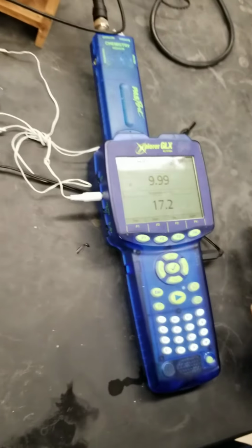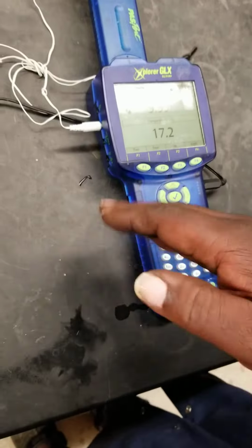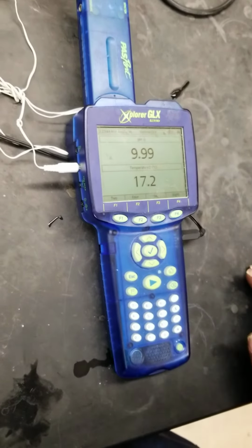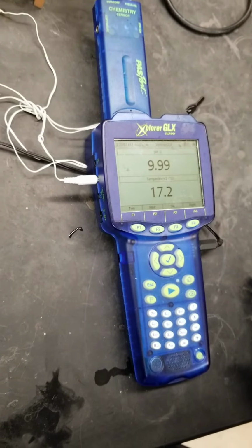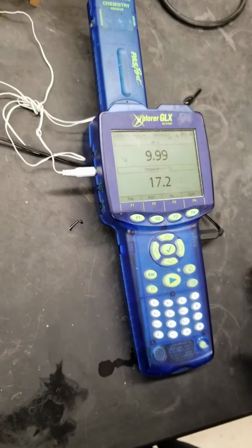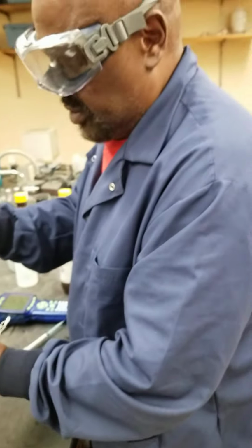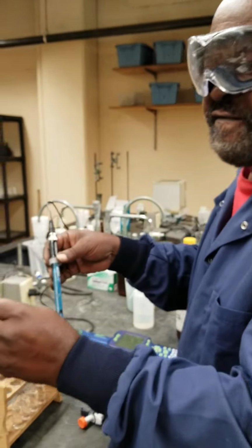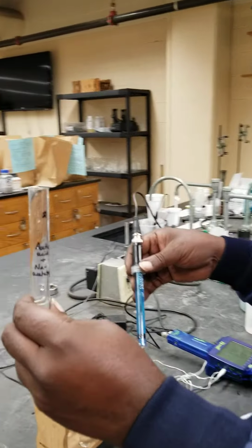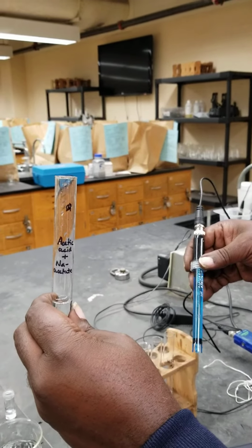So what I'm doing here is just checking that I calibrated properly by measuring either of the buffer solutions. This is supposed to be pH 10. It's reading 9.99. That is good enough. All right, so what I have here is 5.00 milliliters delivered by the auto pipetter.